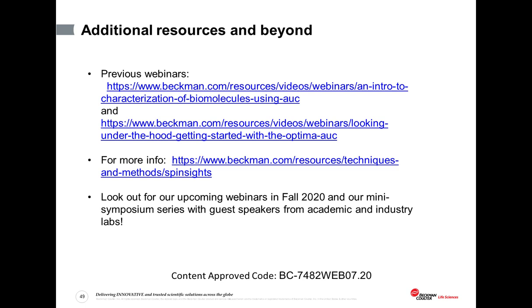Okay, sounds good. The next question is asking about comparing and contrasting SEC-MALS, which provides molar mass information, compared to AUC. Can you speak to that, Akash? So SEC-MALS is a really great technique. It's a complementary technique to AUC. And you get really good information regarding molar masses.